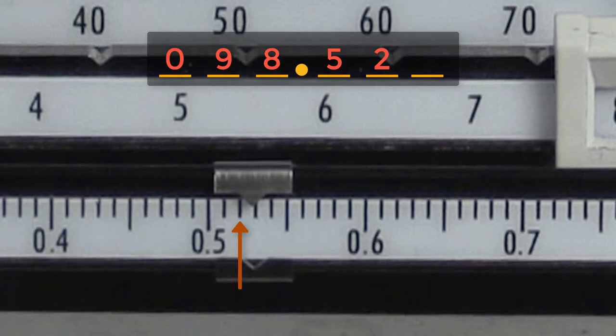Now we need to make an estimate. In our mind's eye, we divide the space between 0.52 and 0.53 into ten equal parts, and estimate the final digit.